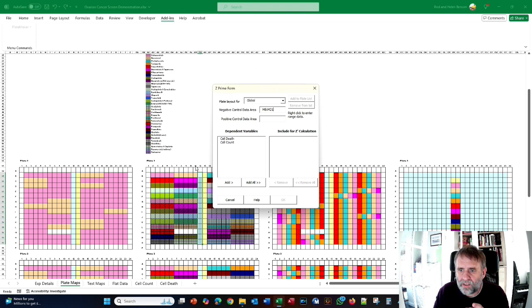Note, this is not this particular set of addresses. This is actually on a plate map. It's actually gone back to the master plates and remapped it so that you get the right address, the right area.